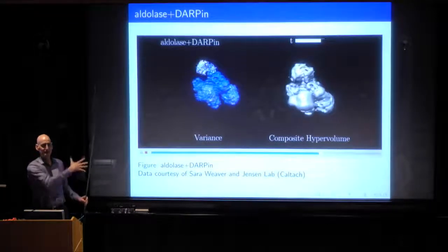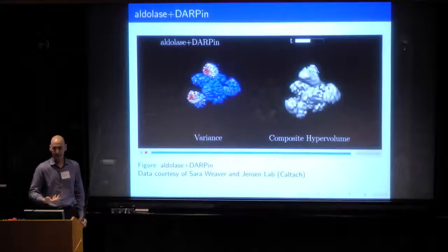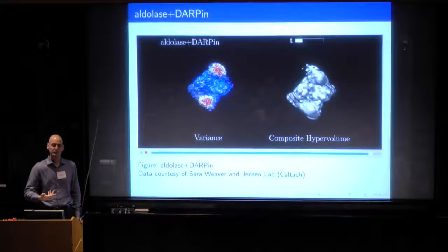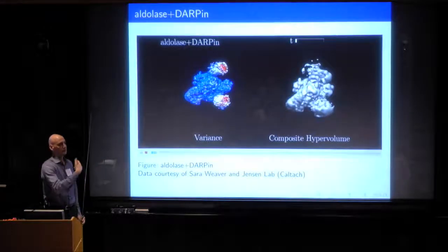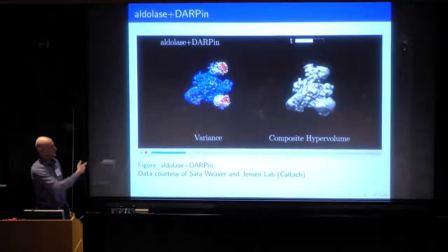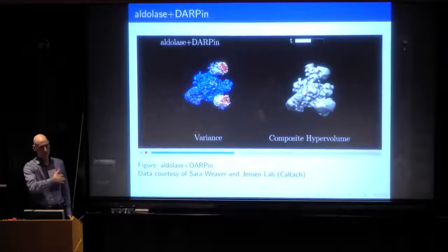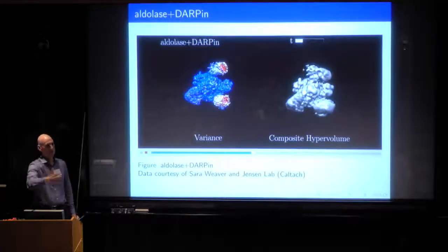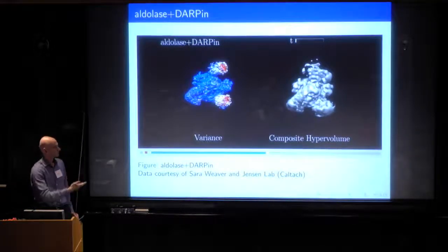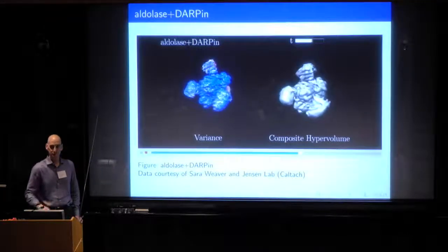We're not really interpreting it yet, because one of the things we need to do, and that's where we're heading now with the new prototypes that we're building, is really to take this to higher and higher resolution. In these, we're only able to use a limited number of images. So part of it is about scaling this. We basically threw out everything and rewrote everything from scratch to make it more scalable and allow us to go to higher resolutions.